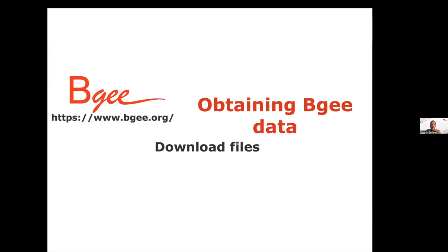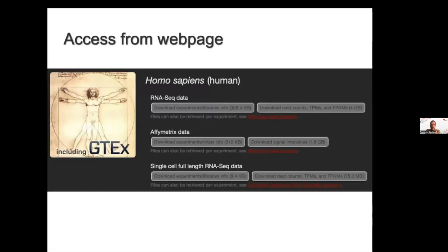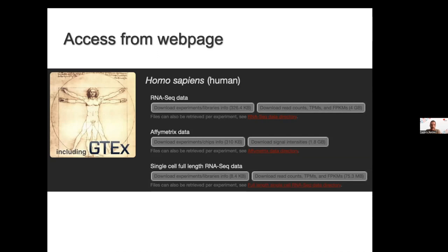How can you retrieve this data? You can go to the BGee website and use the download section for a specific species. There you can access the processed data — bulk and basic data, affymetrix data, or single-cell. On the current release, full-length data is available, and I will also show you the annotation of droplet-based data.